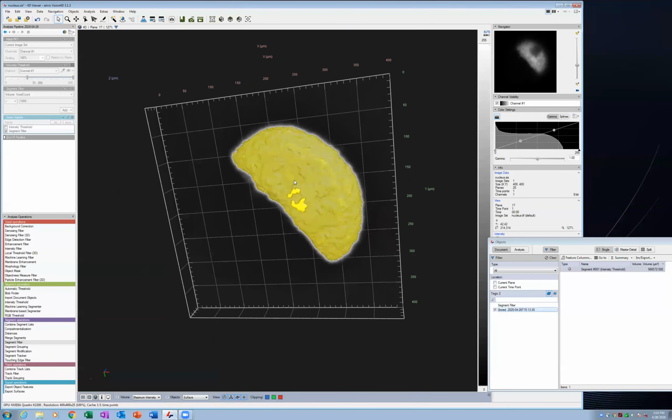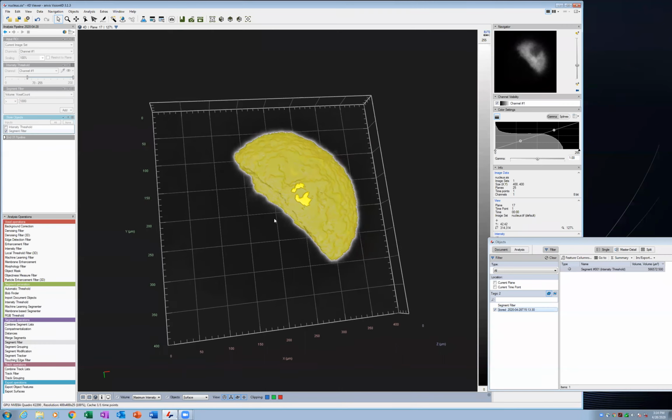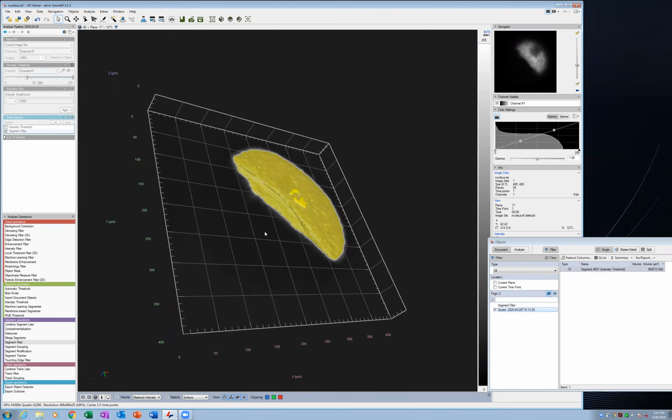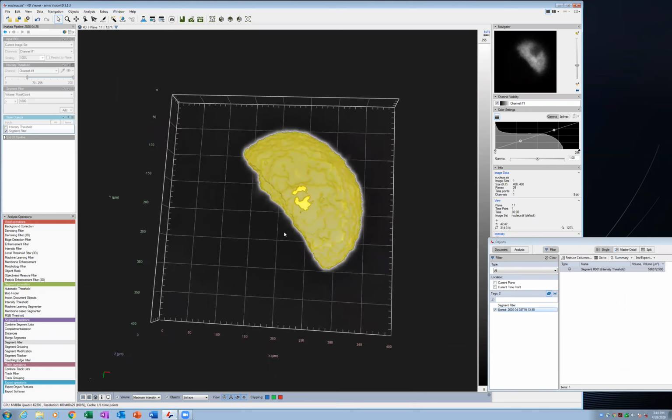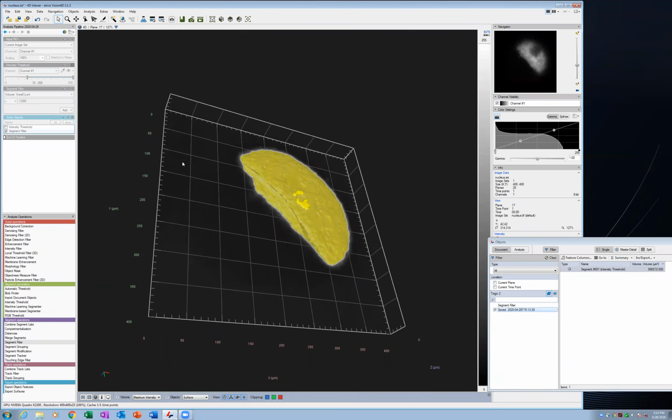And if I'd actually shown you, this was originally a 2-channel image. I think it had lysosomes, or I think it was lysosomes with the other label. You can see this was actually near the edge of the cell, and then the cytoplasm came out this way on the left here. And a bunch of those organelles were packed up against the nucleus here. So that's what's actually carved out in the inside there. So that's just the really simple manual thresholding that I showed you before in ImageJ.